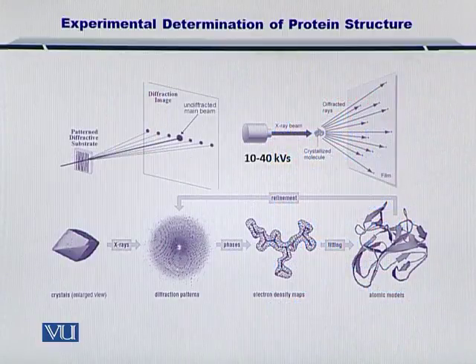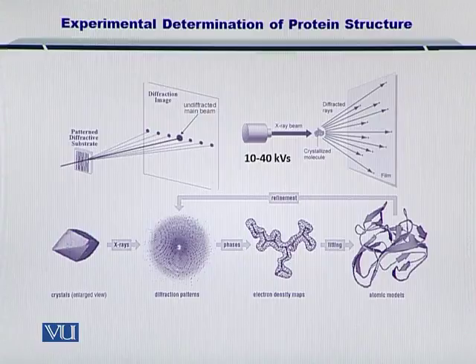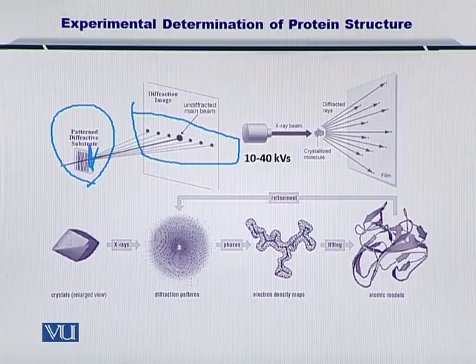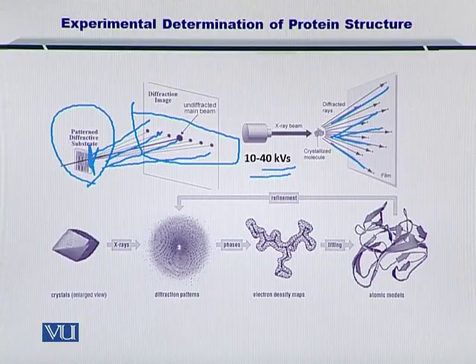In this figure, there is the entire schema of how X-rays are used to measure the crystalline structure of a protein. So if you simply shine different X-rays onto a sample, then you see these diffractions occurring as shown here. So these diffractions, once they are occurring, you can just measure the position of each atom by solving these diffractions.